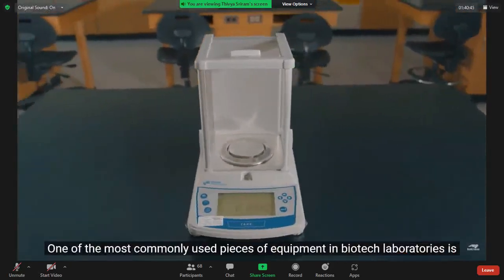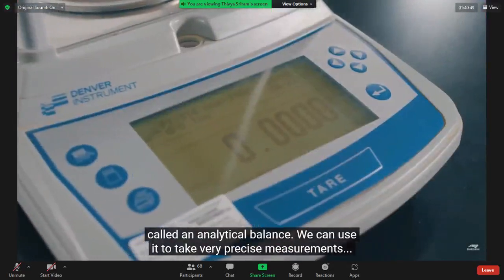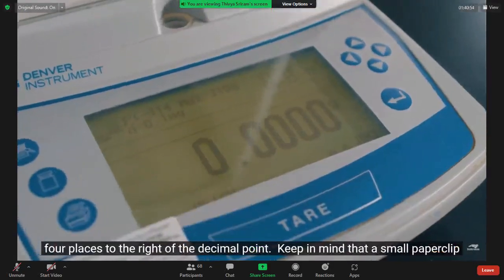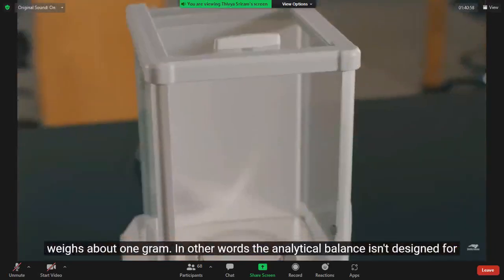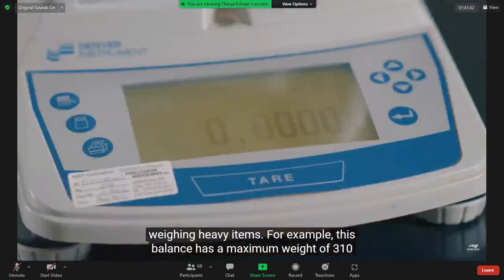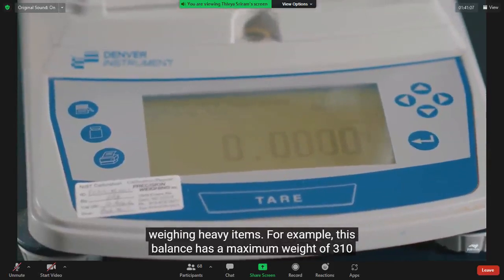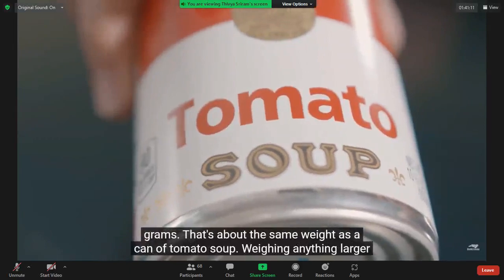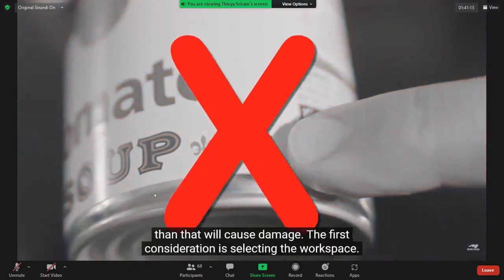One of the most commonly used pieces of equipment in biotech laboratories is called an analytical balance. We can use it to take very precise measurements, 4 places to the right of the decimal point. Keep in mind that a small paperclip weighs about 1 gram. In other words, the analytical balance isn't designed for weighing heavy items. For example, this balance has a maximum weight of 310 grams. That's about the same weight as a can of tomato soup. Weighing anything larger than that will cause damage.